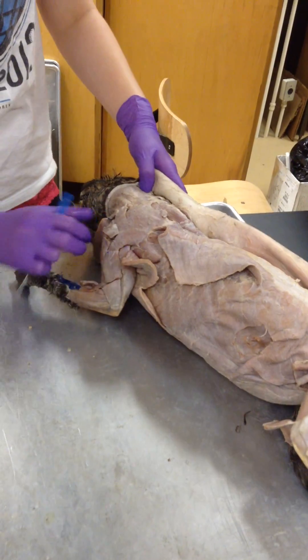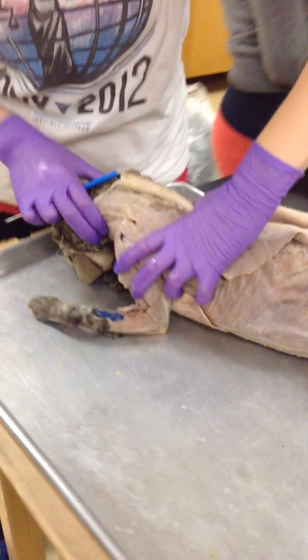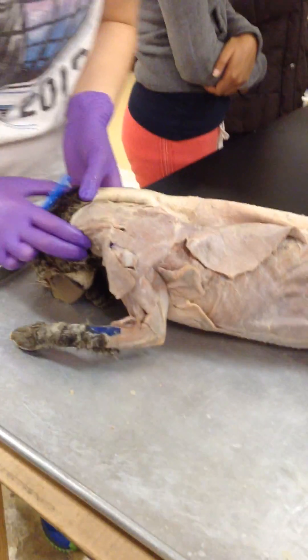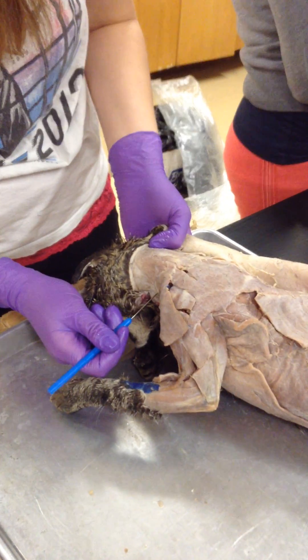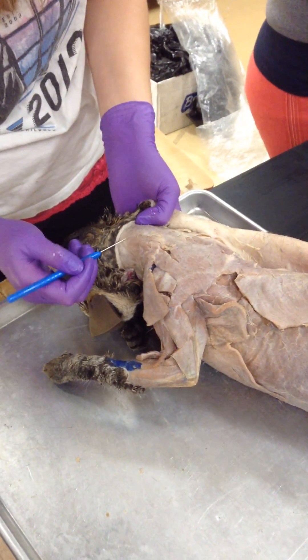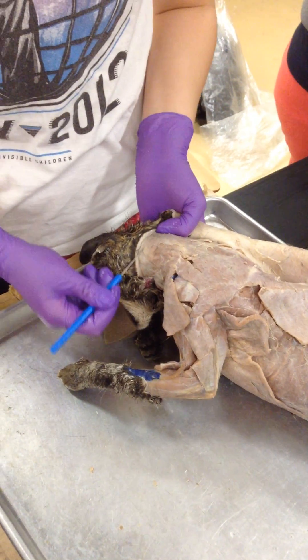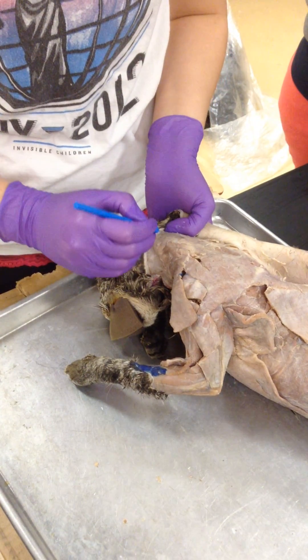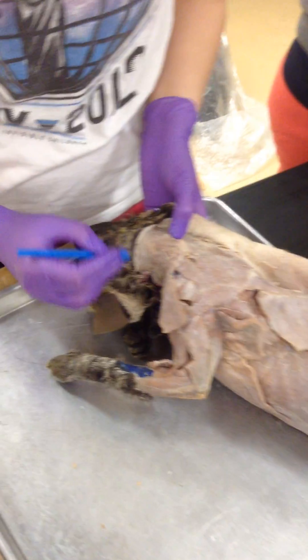We'll start up here so you can kind of see. Can you see? The neck — you see how this line goes here, into here? This is your clavotrapezius. This goes to right here, so this whole muscle is your clavotrapezius.